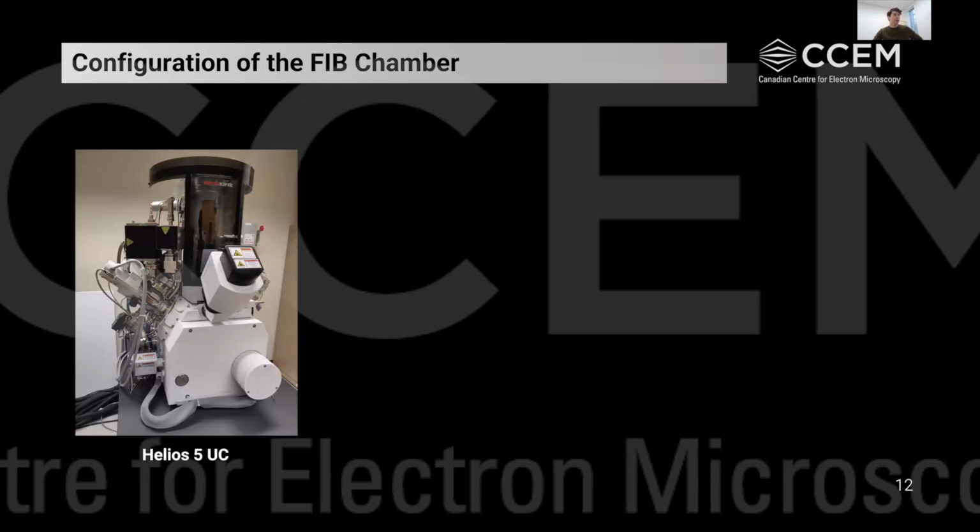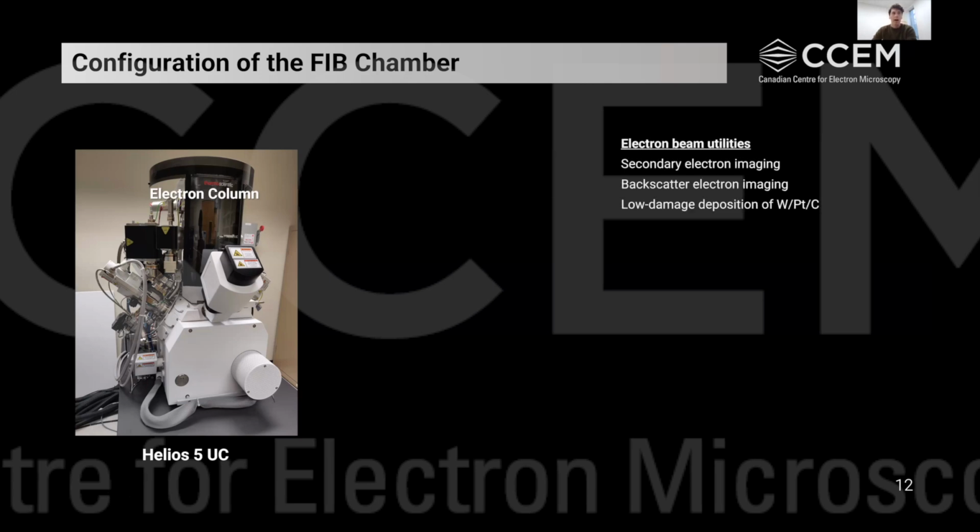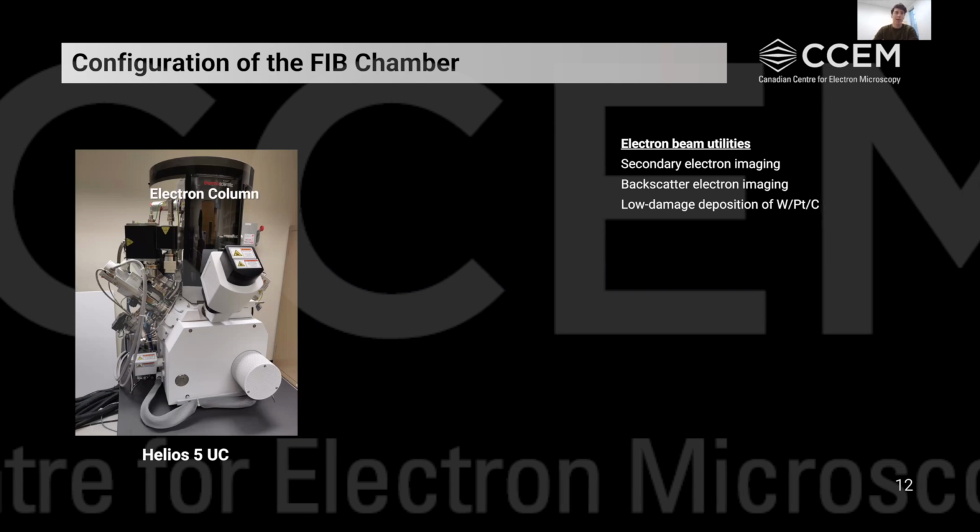If we're looking at the FIB chamber, this is our Helios 5 UC as an example. It's quite a complex system. Up at the top here, we have the electron column. This is where electrons are generated and pointed towards the sample. This electron beam is able to do imaging, but as well, it can be coupled with the gas injection system to do a low damage type of deposition of low purity tungsten, platinum, or carbon.